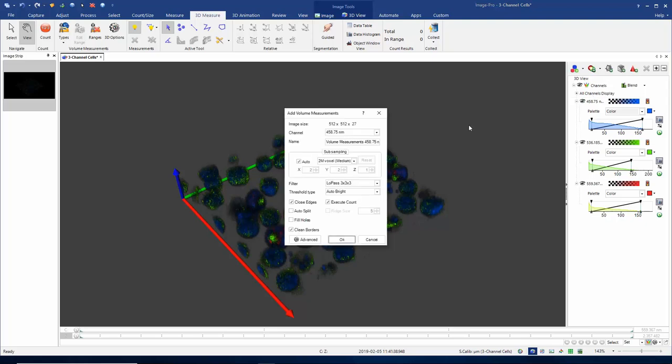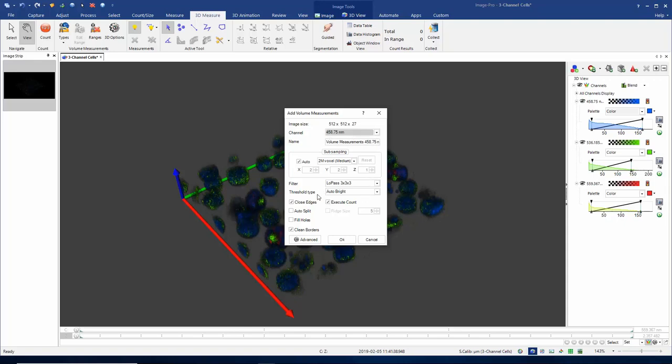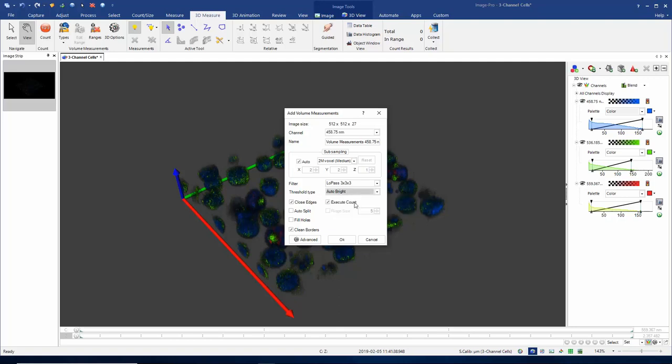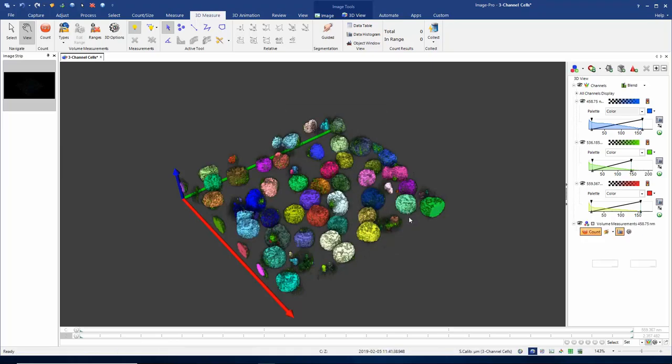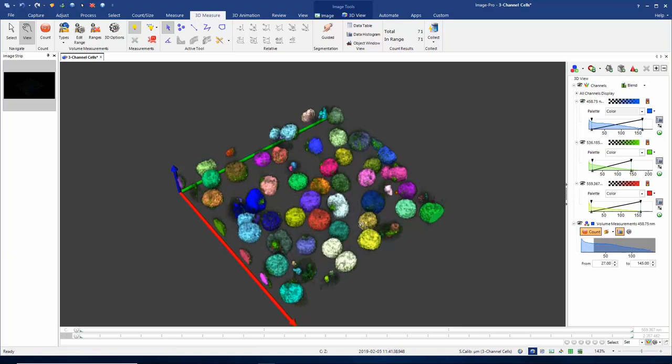When I choose this option, I first have to select the channel on which I want to base my selection. This is my DAPI channel, 458 nanometers. I need to tell the software how to threshold out my objects, so I'm going to start off using an auto bright option. I'm going to choose the option to execute the count. As soon as I click OK, we should execute the count and close edges.